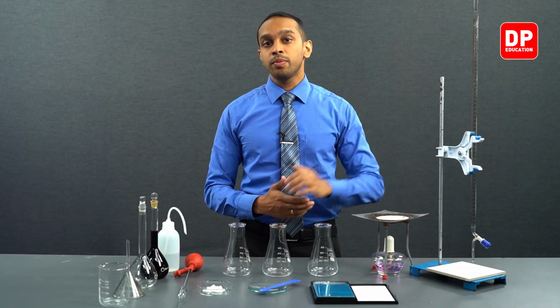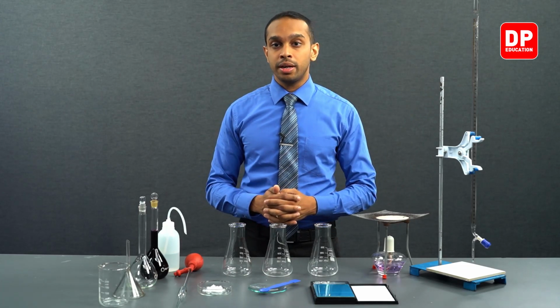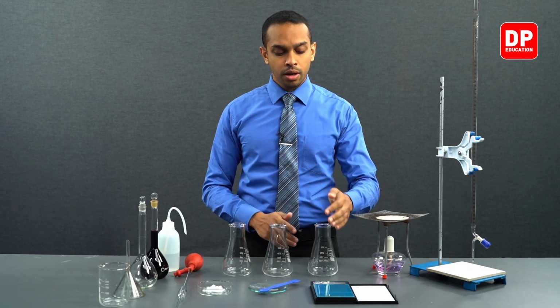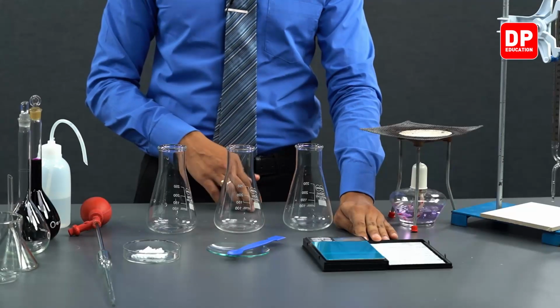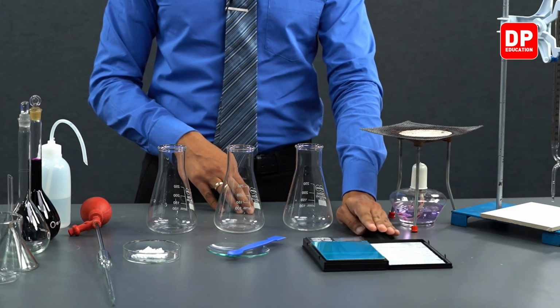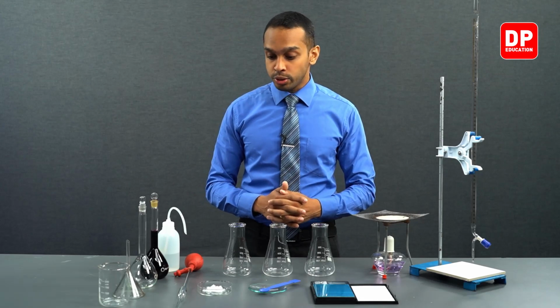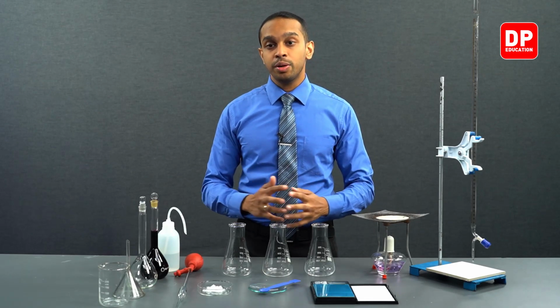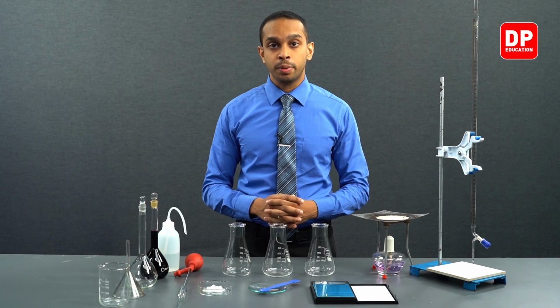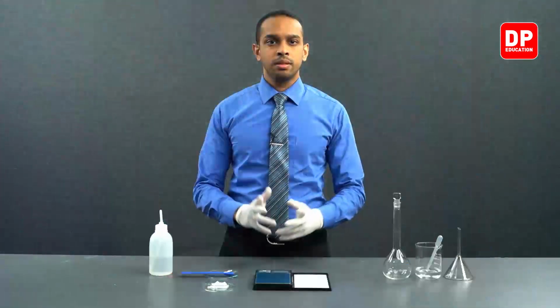And finally, to carry out the titration, we will be using a burette as well. To measure the mass of the solid, we will be using a digital balance that we have here. So, those are the equipment and the reagents we will be using for this practical. Let's move on to our practical.